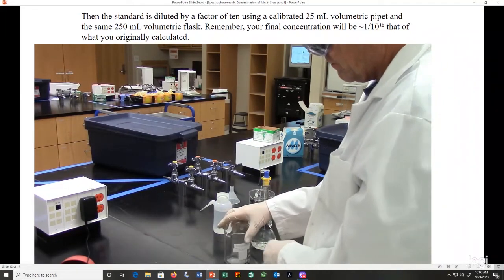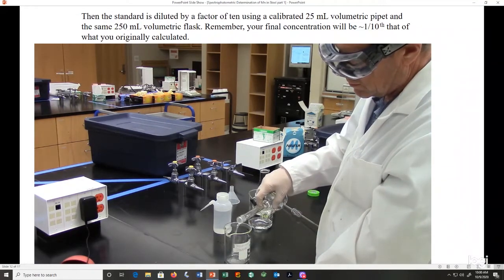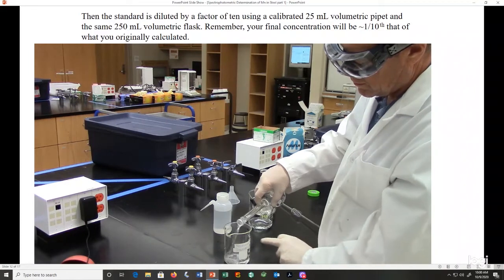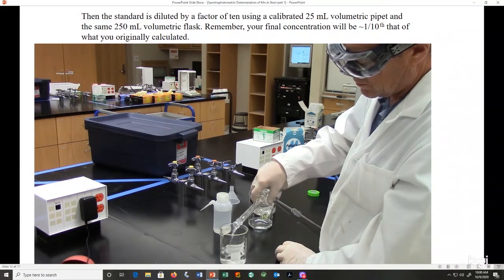And then finally we're going to transfer that to a beaker that's labeled Manganese Standard. And put some parafilm over the top.